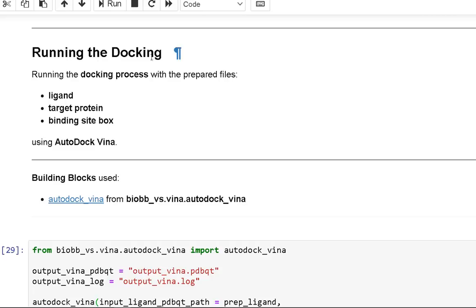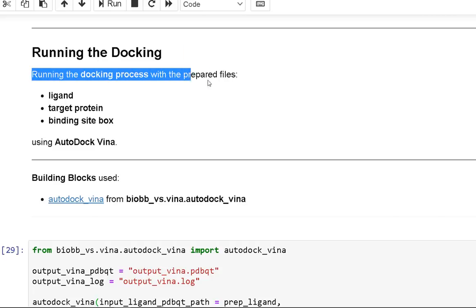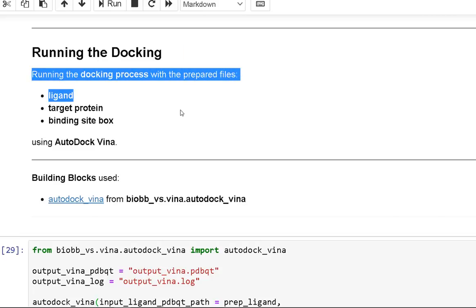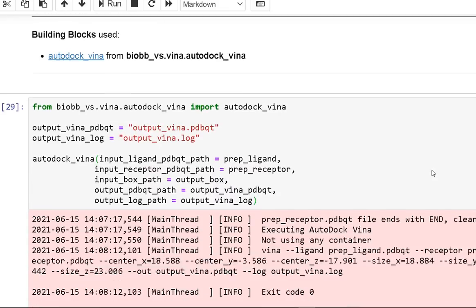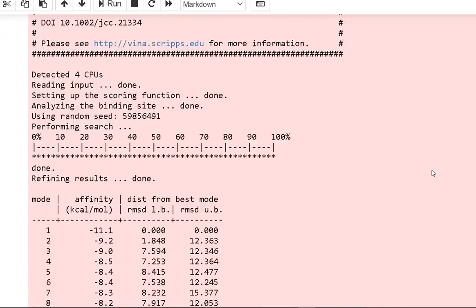Running the docking: using the provided files — the ligand, target protein, and binding site box — to run the docking process.